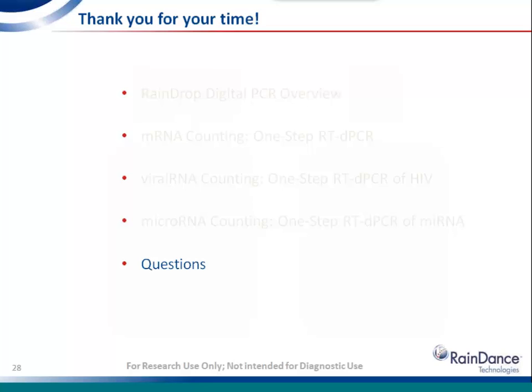Can the assays be multiplexed to look at more than one virus or drug-resistant variants? Yes. So when it comes to multiplexing, I showed you a number of multiplex assays, what I call triplex assays or fourplex assays.